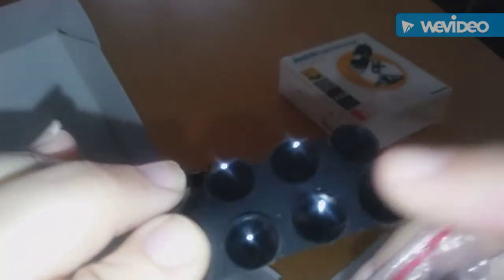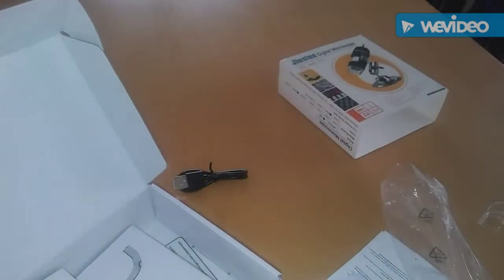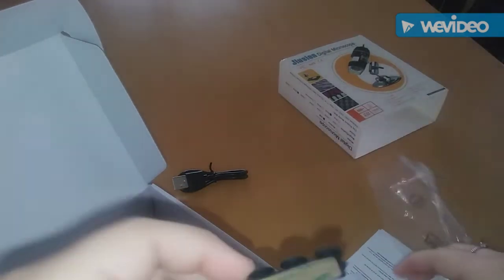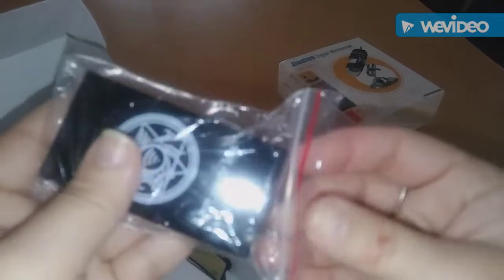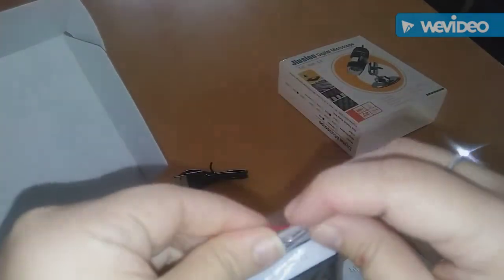Then you have this thing here — I think it's to hold things down, something with little suction cups. And then you have this — this is your WiFi box. You're going to need this when you connect it to your phone.